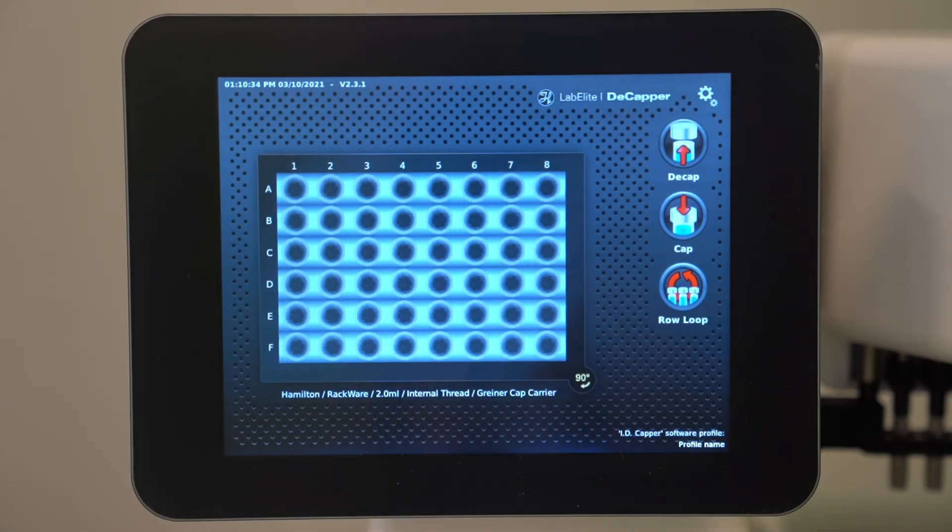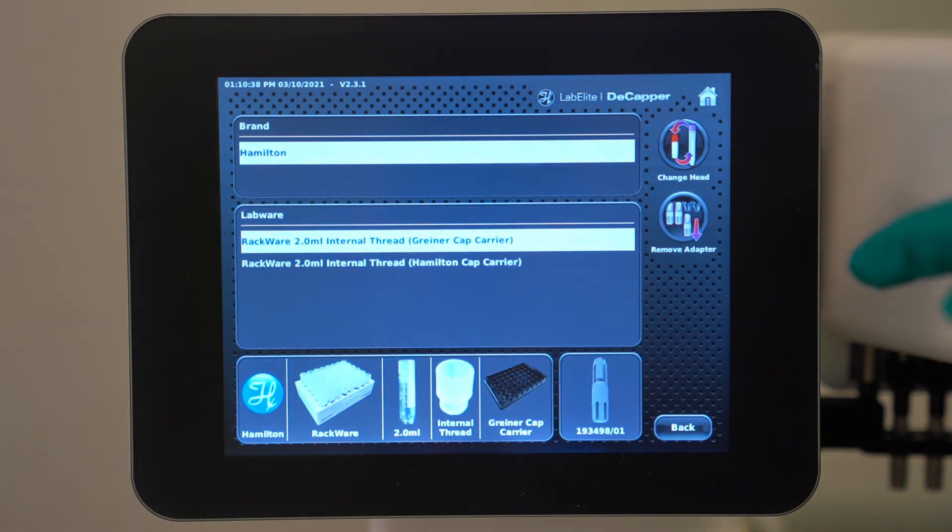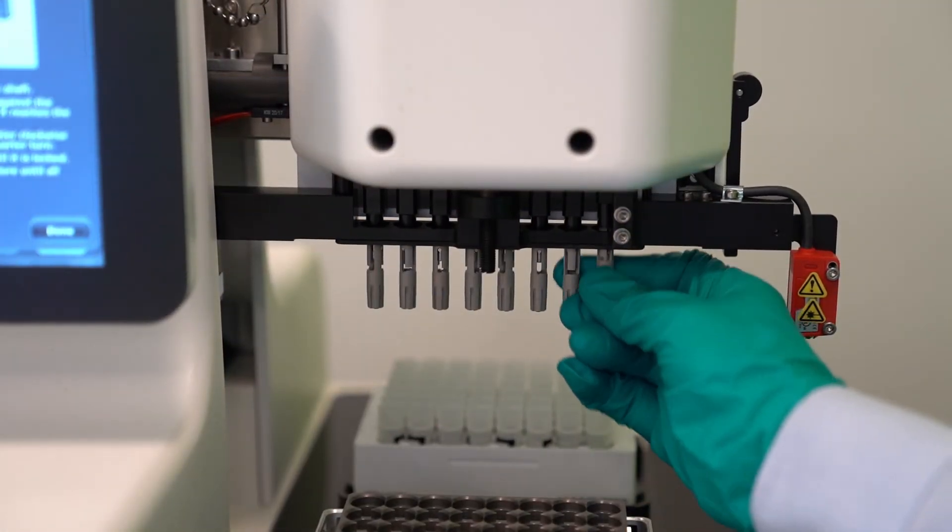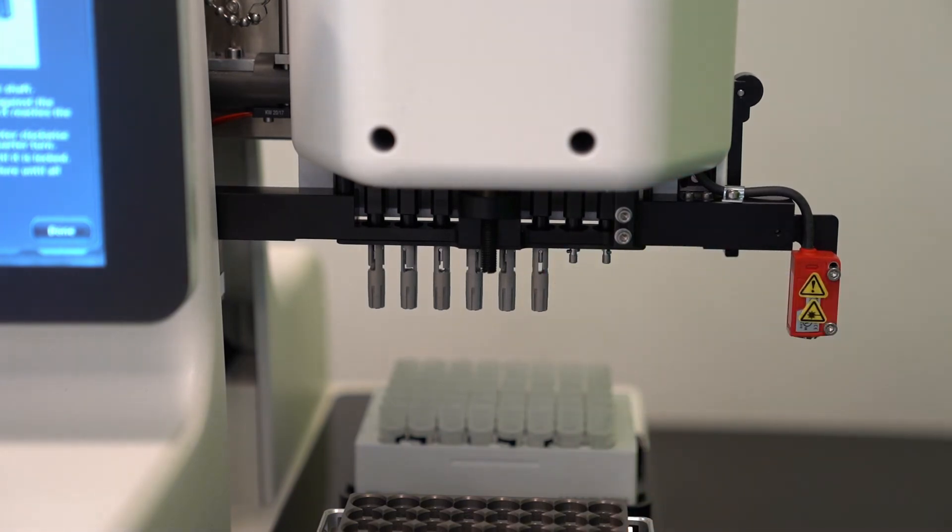To change the adapter sets, select system settings on the touch screen, at which point the system will walk you through the process. To change out the bit, simply press up, rotate a quarter turn, then pull down. To install new bits, simply reverse these steps.